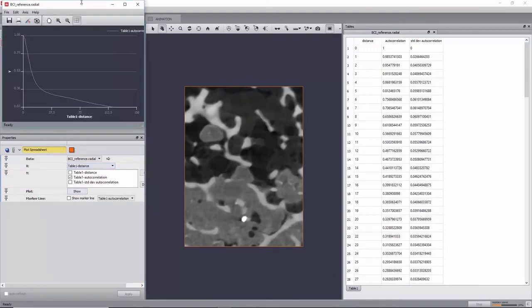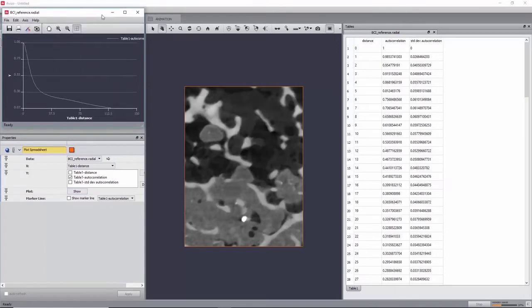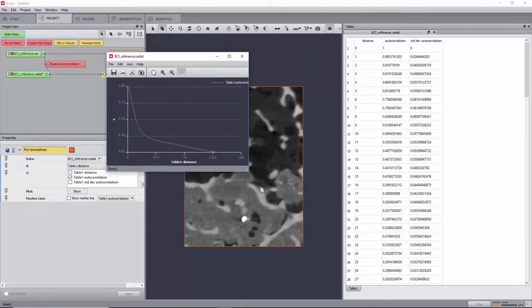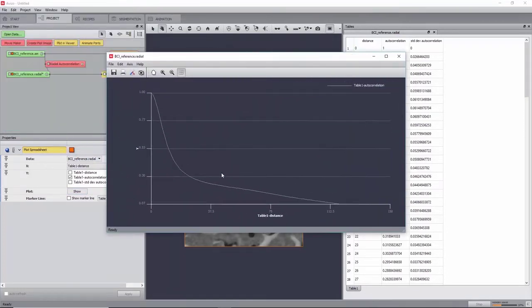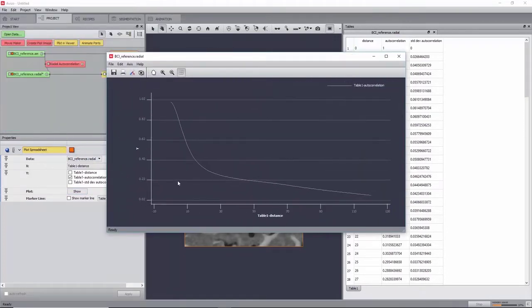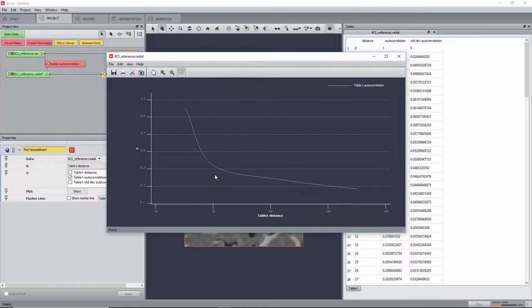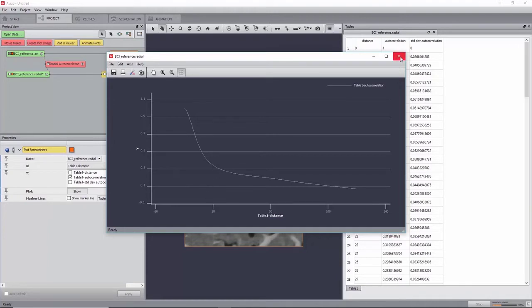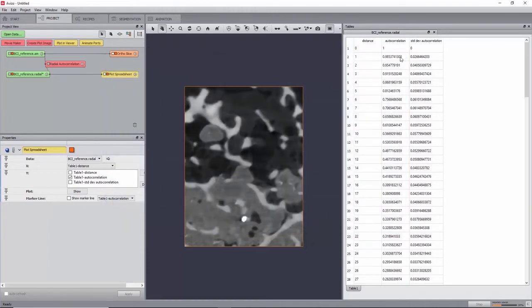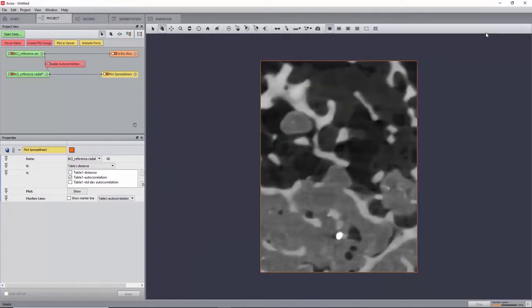A graph will appear in a new window. The characteristic length of a microstructure can be defined as the distance for which an inflection point can be observed. Here, we can define it at around 20 voxels. As a rule of thumb, the sub-volume size for a DVC analysis should be 3-4 times greater.